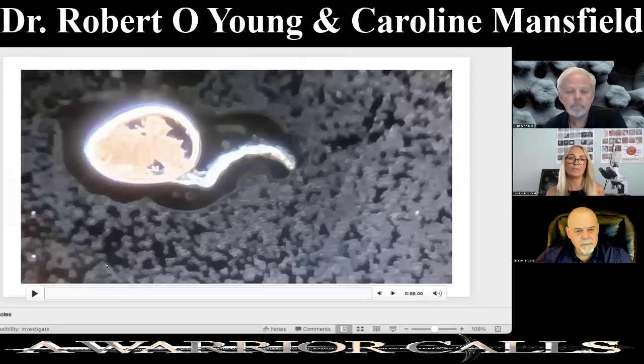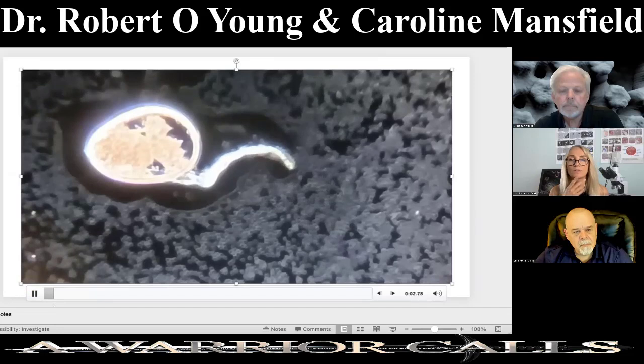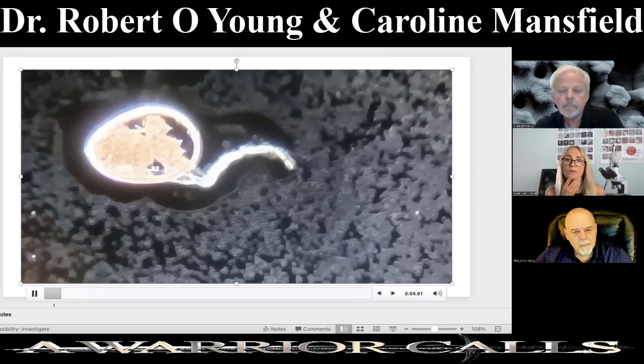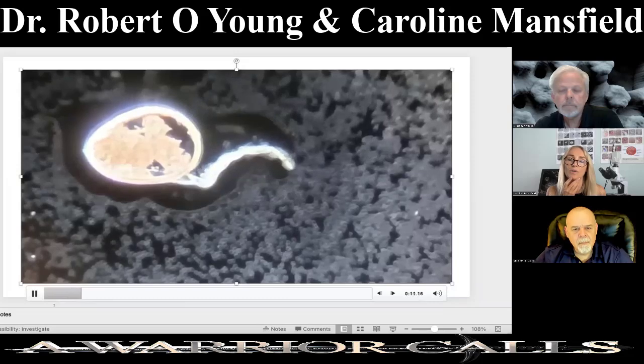So this is the only video that's not mine. Somebody sent this to me, and I found this quite interesting, because if I just quickly play this, you will see that this construction site or polymer connected up with one of these structures is actually sucking red blood cells into its body.